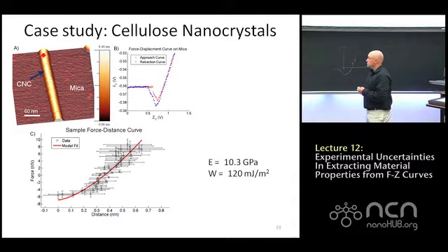Okay, so in the force versus Z curve, W comes from the minimum value of the blue data. Yeah, so it's just a different way. There are two ways to find the minimum, right? One, you can just take the minimum. The other, you could take the minimum from the model. I guess it's debatable as to the relative merits and disadvantages of doing it both ways, but you should get roughly the same answer. And again, my concern is usually more elasticity than work of adhesion, because work of adhesion isn't a material property, so I'm not quite as concerned with it generally.